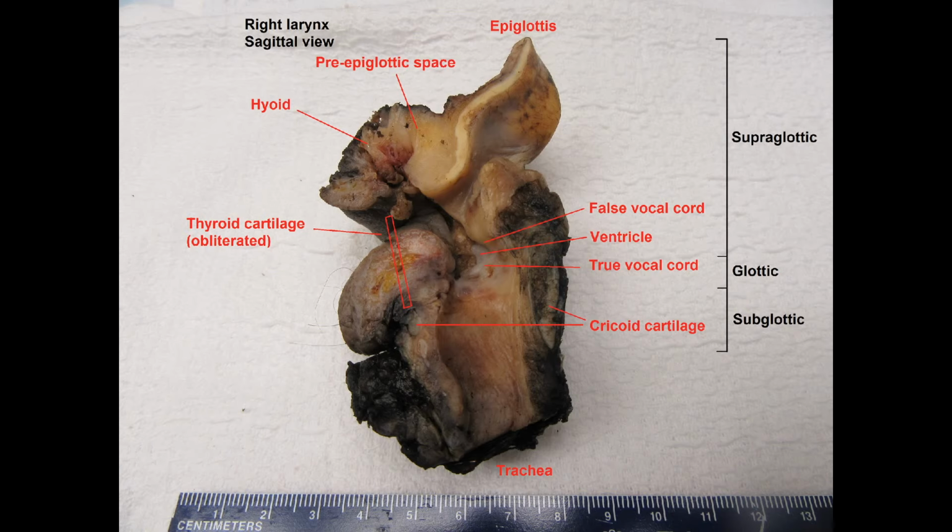So it's good to know that it's these very close measurements that we can't really tell grossly, that we need to sample and make sure that we give you a good section of, because you're really the one who can make the distinction between those millimeter differences.